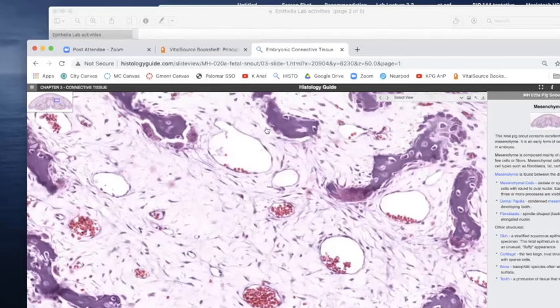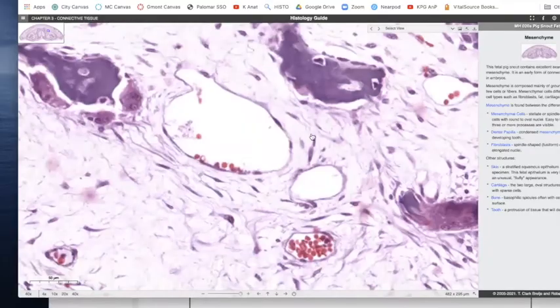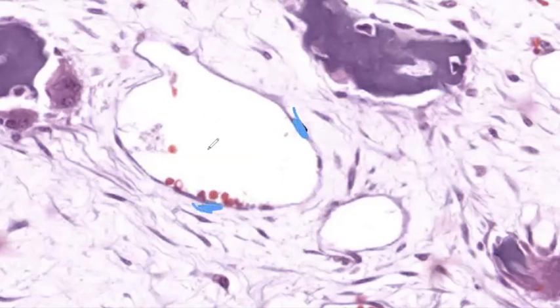So you see blood vessels, the cells lining the blood vessels, and this could be anywhere. You could look at all these various blood vessels around. The cells lining it are going to be those simple squamous cells. And so here's the nuclei of it. Let's make a different color, blue. Here's the nuclei. And of course, not all of them are going to be in plane with this particular sample, but there's a couple, maybe there's another one, and then their cell body, they're all going to be connecting somehow, somewhere.